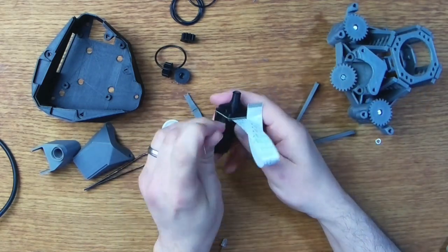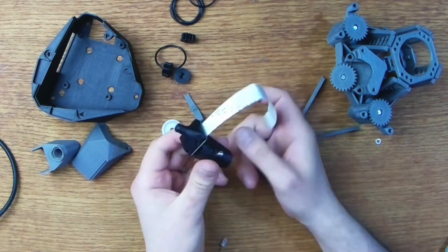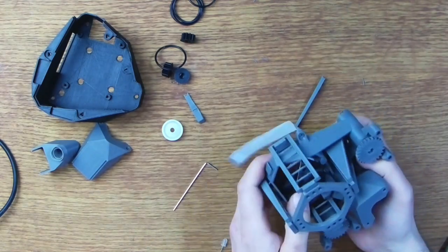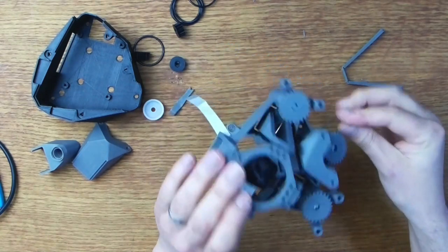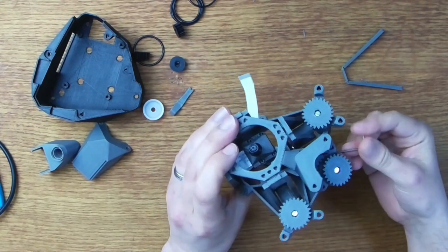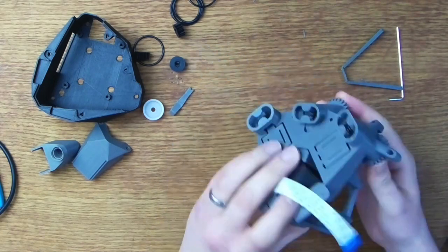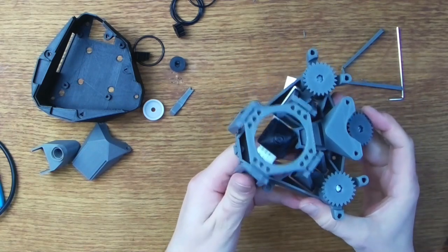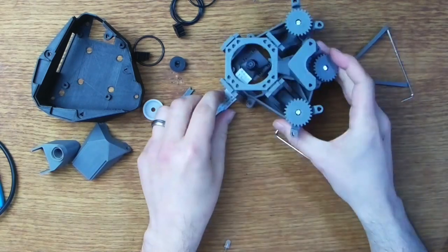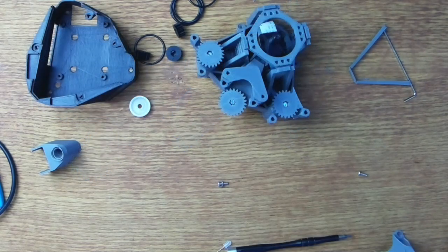The camera module just uses another captive nut and a bolt that fixes into the adjustable Z-axis mount underneath the Flexure's moving stage. This movement allows the system to provide an autofocus feature by adjusting the camera's height. Tightening this bolt up, however, is a little tricky. An access path is provided just to the side of the Z-axis actuator, but it requires a long, thin Allen wrench to reach through. If you're using a screwdriver with a hex bit, then you may find it's actually too chunky to get a good angle on the bolt head.